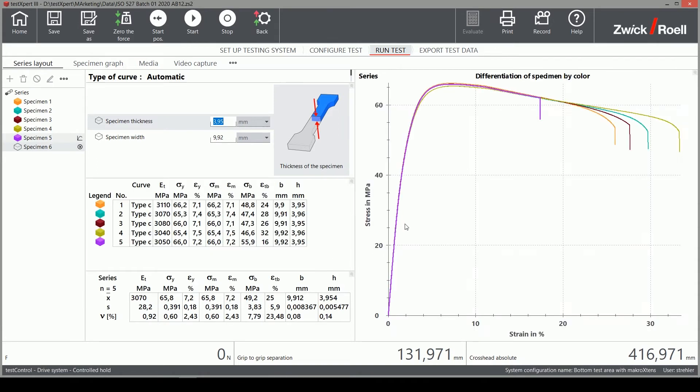The last sample seen here in purple broke a bit early, probably because the sample was not well prepared or there was a flaw from the injection molding. However, the main values are okay.